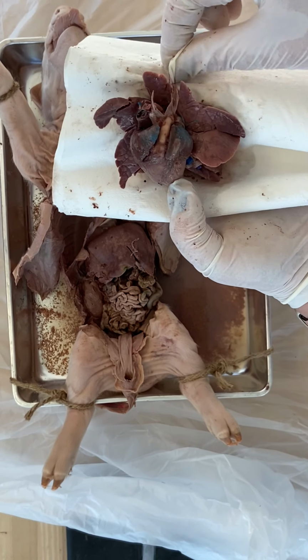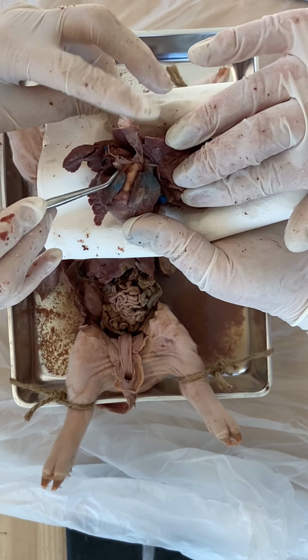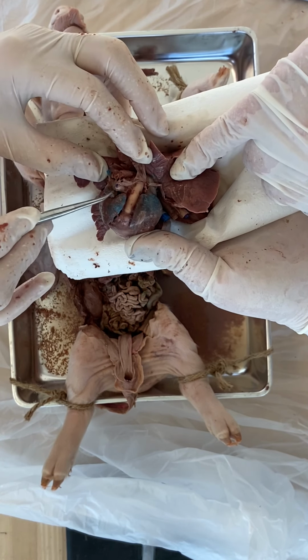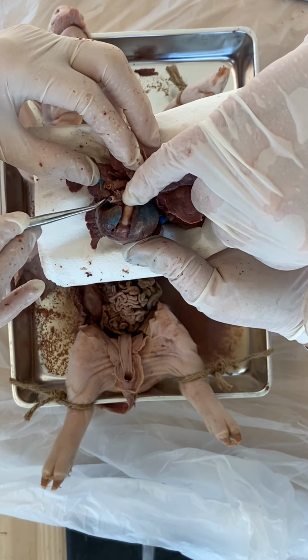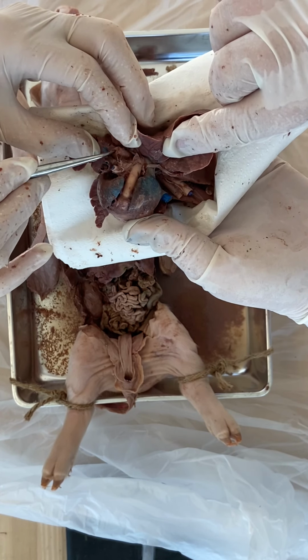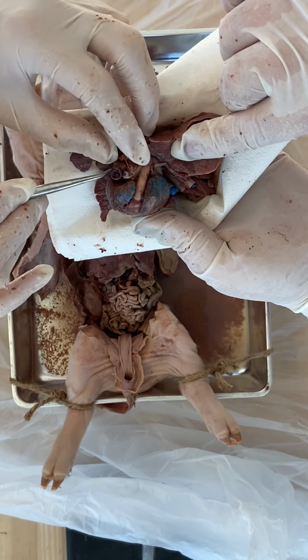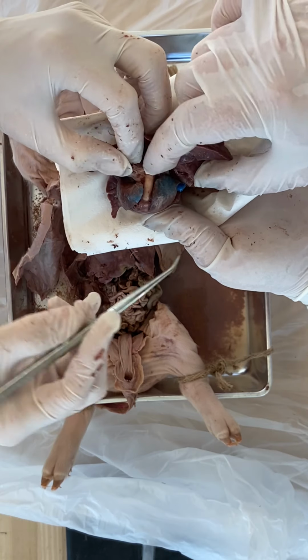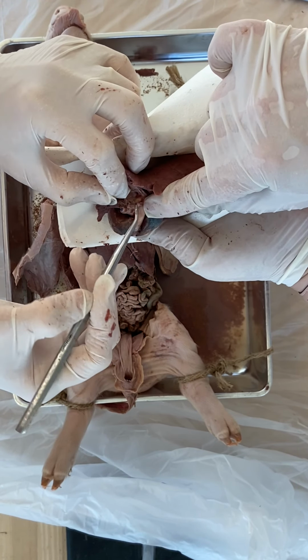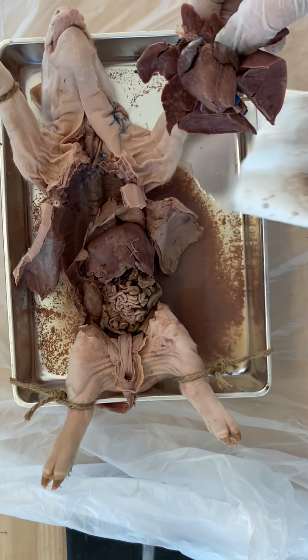And there. Do you see it? You see a lot of extra tissue. Those are the things that hold everything in place inside your body so they don't move around. And then I'm looking for the aorta coming up. I think this is your trachea right here with the C-shaped rings. There's the esophagus. And the aorta should be in here. Is it there? Right there. Okay, should we take the lungs off?